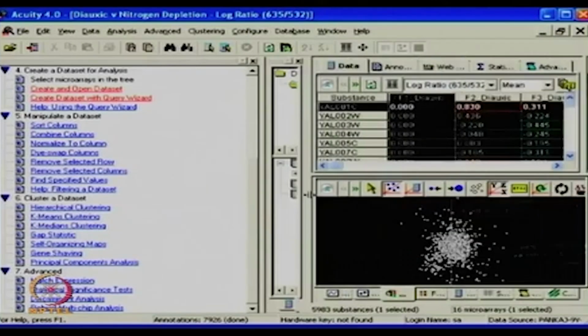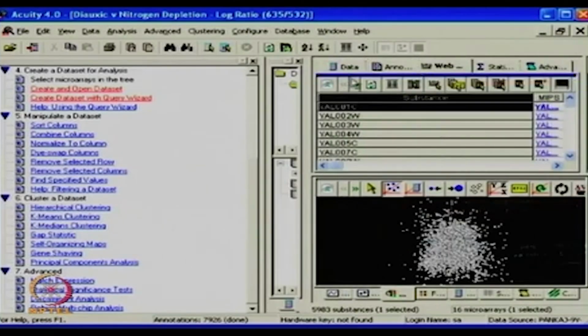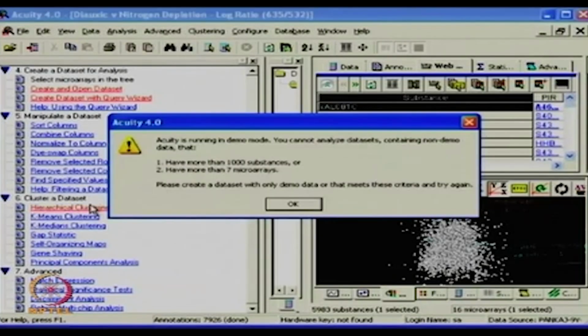And another important thing is whichever is something like bluish in color, that particular one you have selected to work with. Okay, so this is filtered data, allowed to work with. And when I hit a kind of clustering possibility, it says you need to create a quick data set.